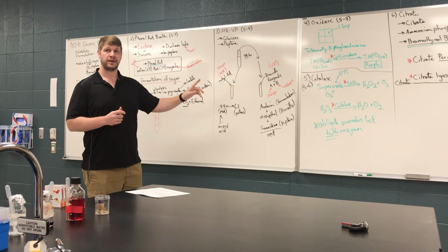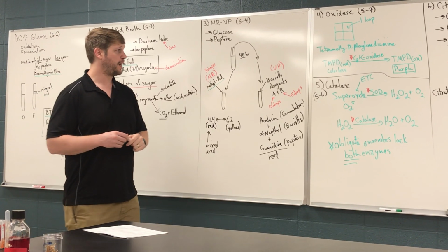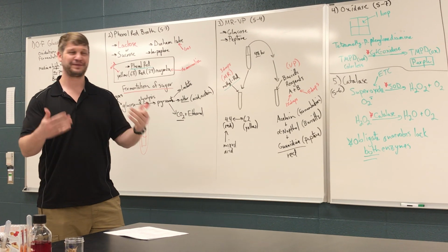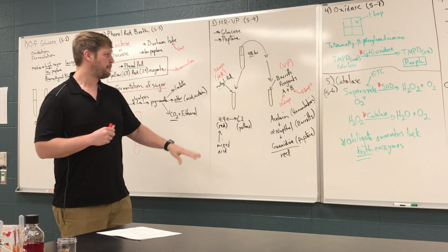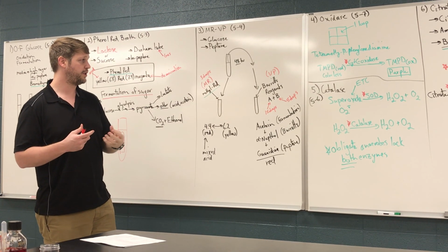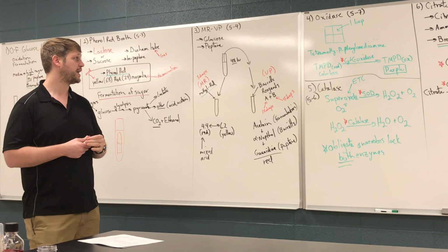All right. The next one is called the MRVP, which stands for Methyl Red Voges-Proskauer. Again, I always wish that they'd stop naming things after people instead of telling you more about what's actually going on. In this case, you're going to inoculate a tube that has glucose and peptone in it, so it's sort of a general nutrition source. It has both some sugar and some protein base, plus a few other things that come along with the peptone.